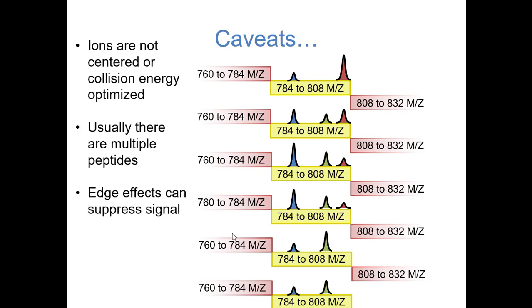Okay. One additional issue with this is that there are edge effects that can affect the signal transmission. What does that mean? Usually quads aren't perfect, right?